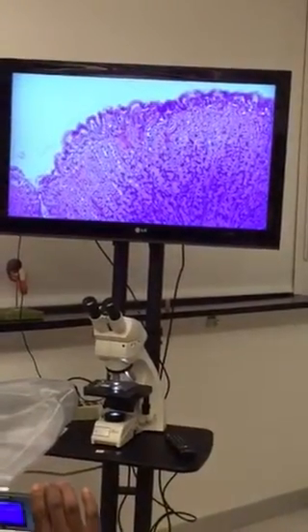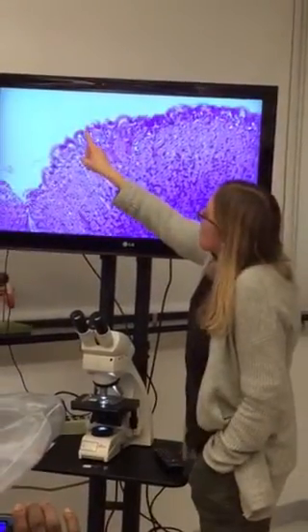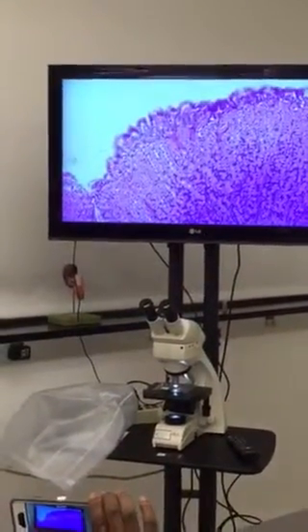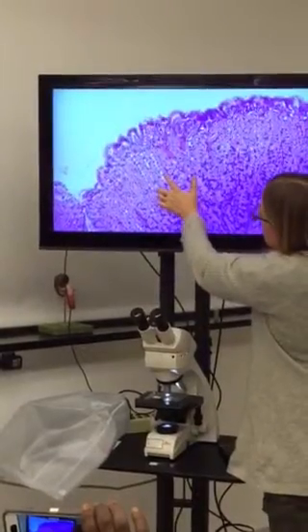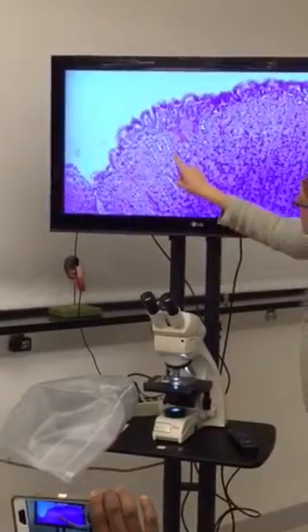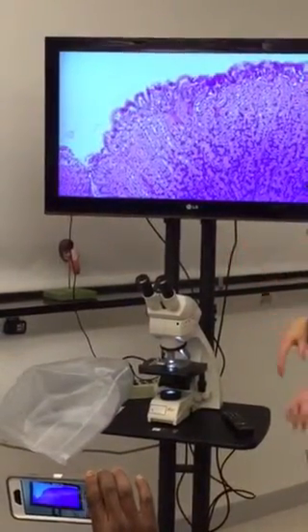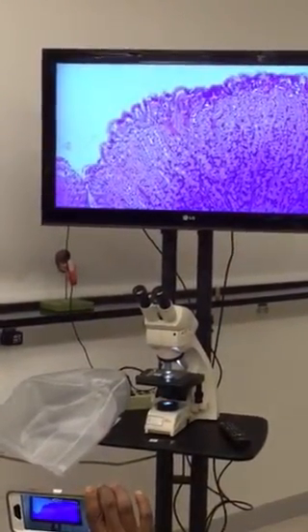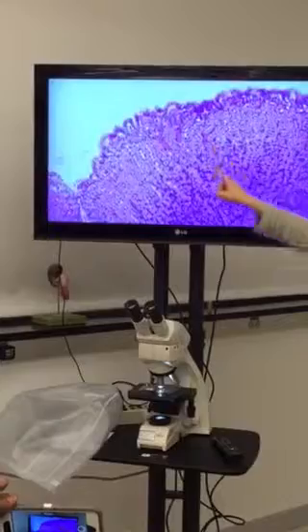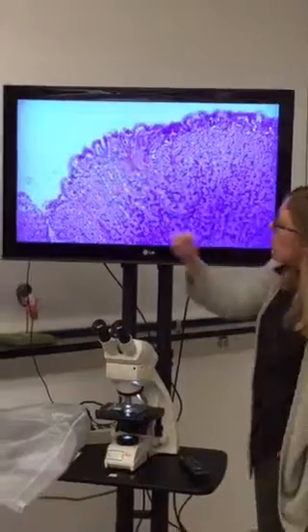Gastric glands. Yep. Gastric just refers to the stomach. And the pits are actually the little spaces in between the simple columnar that reach deep down into the mucosa. The white spaces? Yep, the white spaces. So there are little cells, see these little simple cuboidal cells lining those gastric pits, those white spaces. So those cells are producing mucus, some other stuff that breaks down protein. We'll talk about pepsin later on. But those are the gastric glands. Okay. And you see them, they're reaching really far, right? All those simple cuboidal, the pink ones, really far. And this is all mucosa.